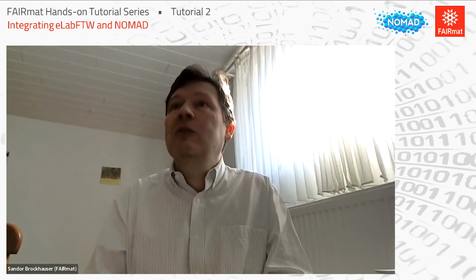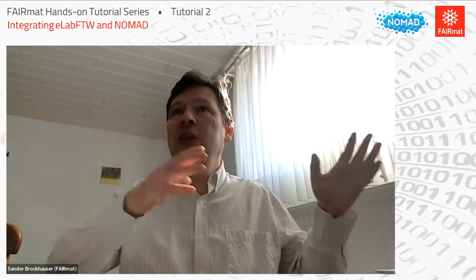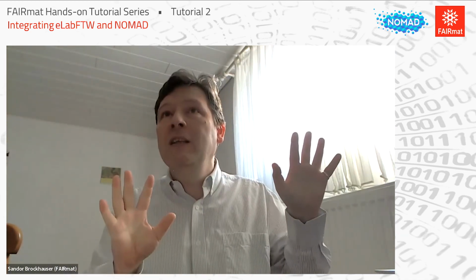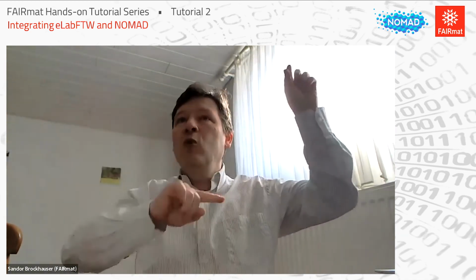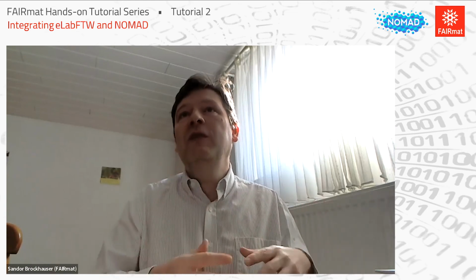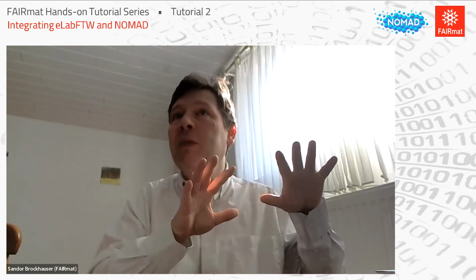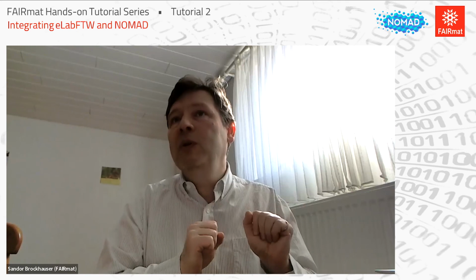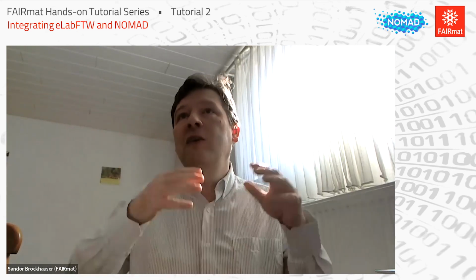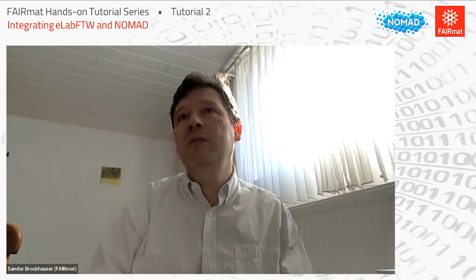On the other hand, it's also clear that it is a transition. It doesn't go from one day to another that everything becomes well-defined and annotated, that there is an ontology behind it, and you know all the relationships between all the metadata items. No, this is a transition. We have to start with some schema defined. And this is important, that your main workflow in your lab needs to be defined. And then gradually you can increase these definitions more and more.